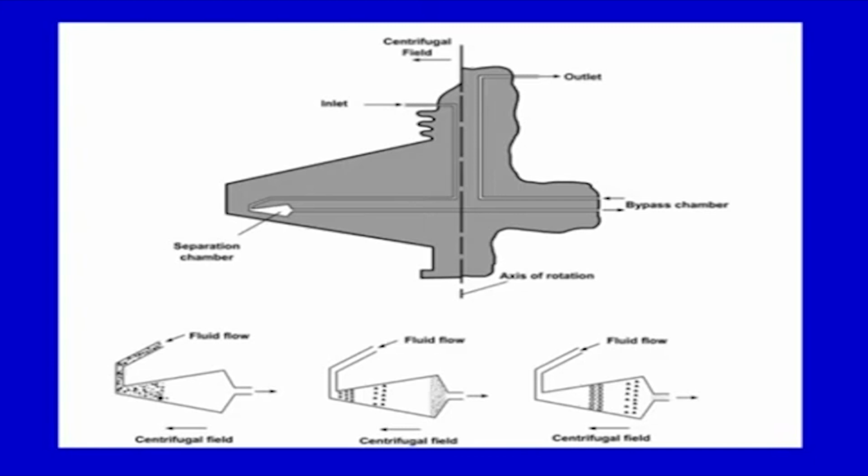So, what are the different stages in here? There are two forces. One is from the inlet, where you are pumping in the material containing the particles, and there is an outlet. So, when you are forcing something from here, there is a flow towards the centripetal end, and the outward force is the centrifugal force, that is the applied centrifugal field. Both will oppose each other, and on that basis this separation takes place.